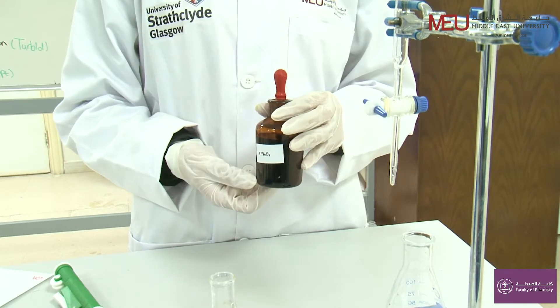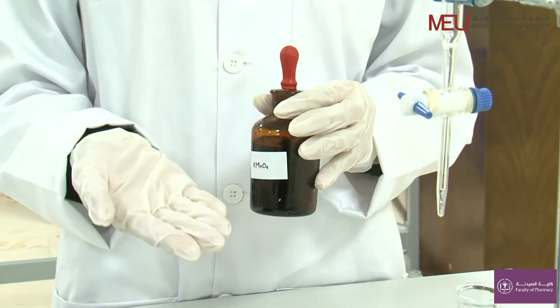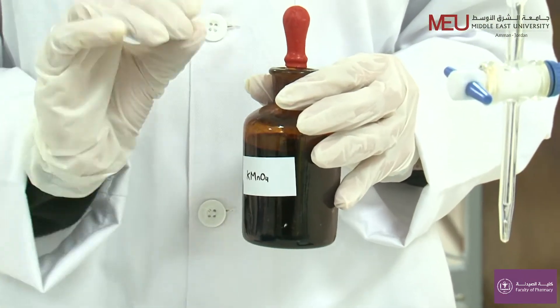Potassium permanganate doesn't survive very well in light, so we keep it stored in a brown bottle and we have to standardize it to find out exactly how much KMnO4 is in a solution.